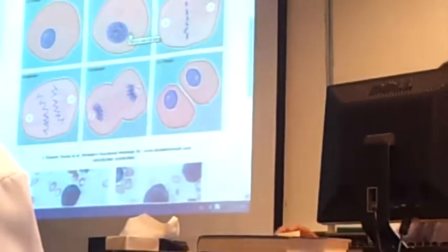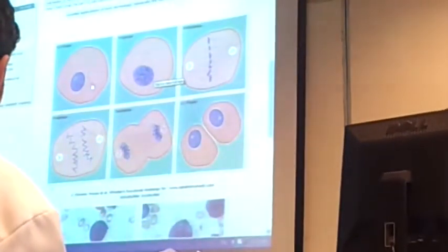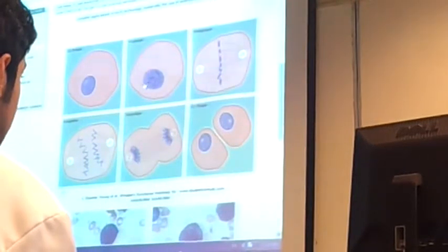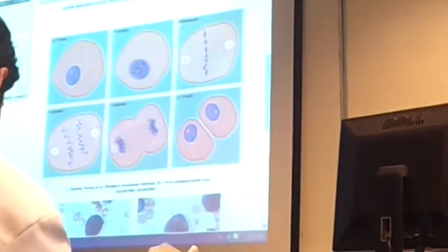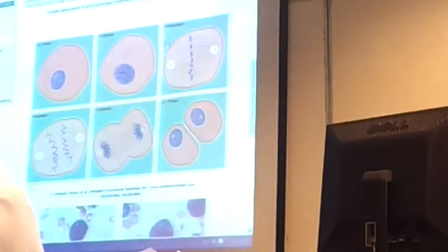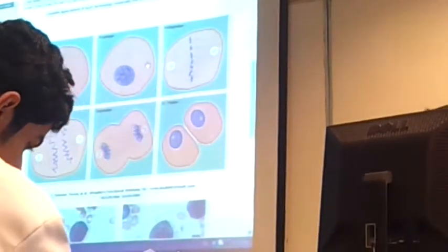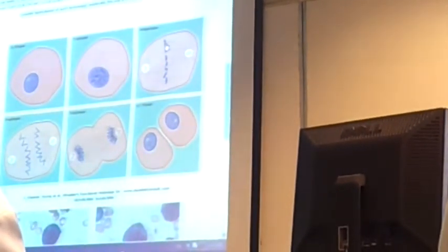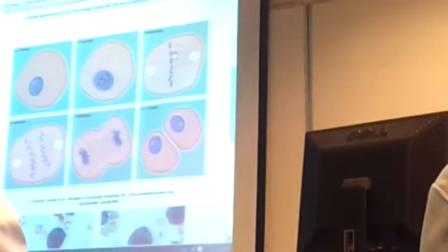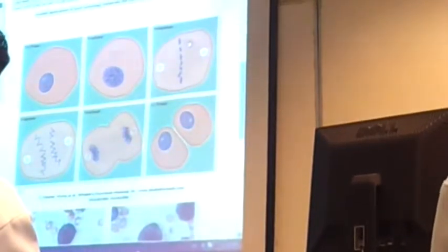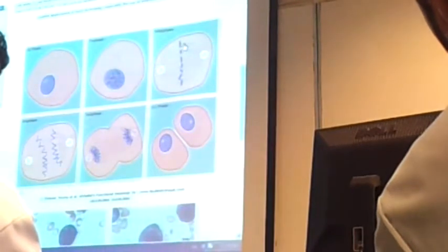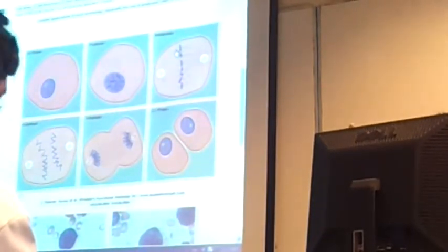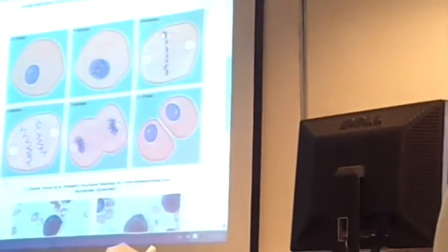This is the description of cell division. You can see different phases - from prophase, where chromosomes are starting to compact and form, then in metaphase the main feature is spindle formation. This is mitosis, so the spindle is visible and chromosomes are present on these microtubules, attached with their centromeres. In meiosis there is a pair present - two chromosomes - but here we see only one chromosome on each spindle.